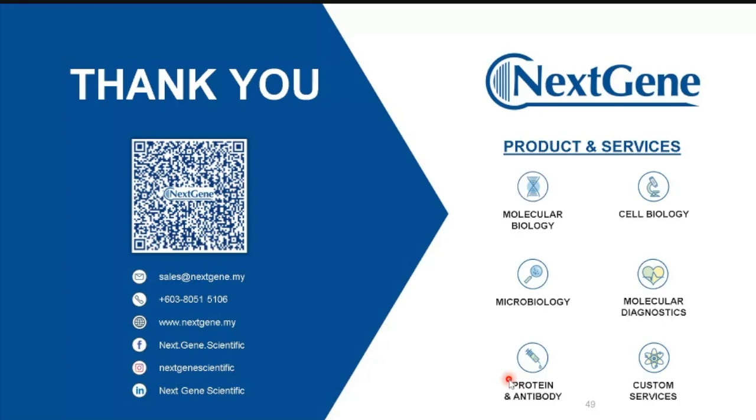Okay. So therefore, the designing part will be quite time consuming and crucial, because when you already receive the plasmid, the price already paid. Okay. So therefore, you want to revert, then you realize there are mistakes. Okay, then it's already delivered, then it will be difficult. So therefore, we try to, let's say, look at the expression vector, choose the correct expression vector, and then choose the RE site correctly, and then try to design it nicely. So we should spend more time during that stage, actually.